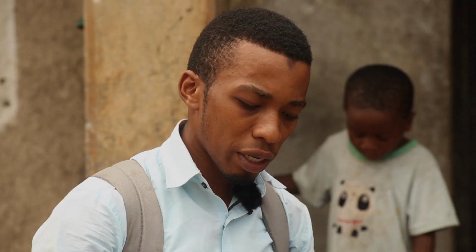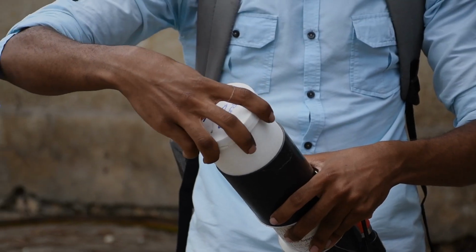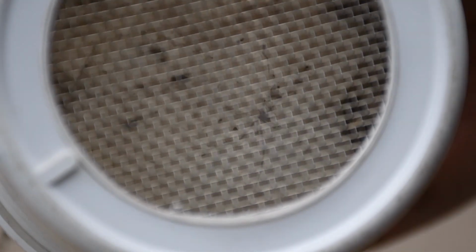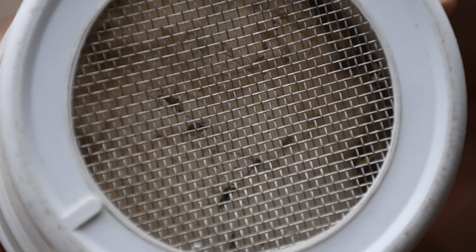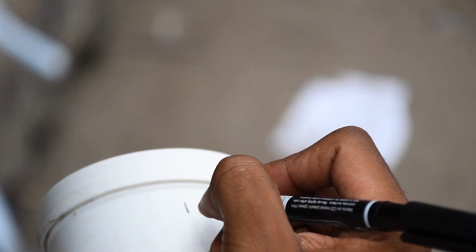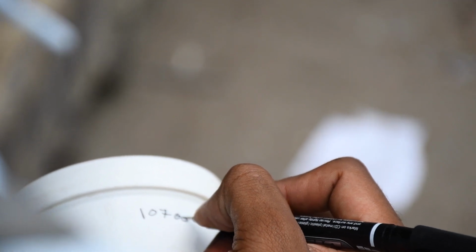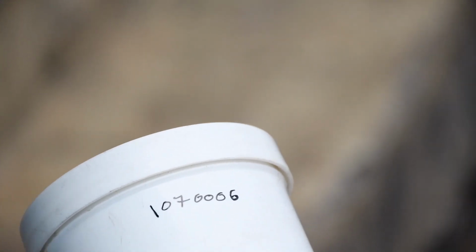Once we've searched and aspirated through all the potential hiding places for mosquitoes, we now remove the cap from the Procopack aspirator, and then we check for the presence of any mosquitoes. You will notice there are some live flying mosquitoes. So we now label the cap based on the location or the sampling site and also the household number. So the location has been assigned number 1, and the household number 7, and then the collection round, which is 6. So this code can be used to trace the mosquito back to the household and the site of collection.